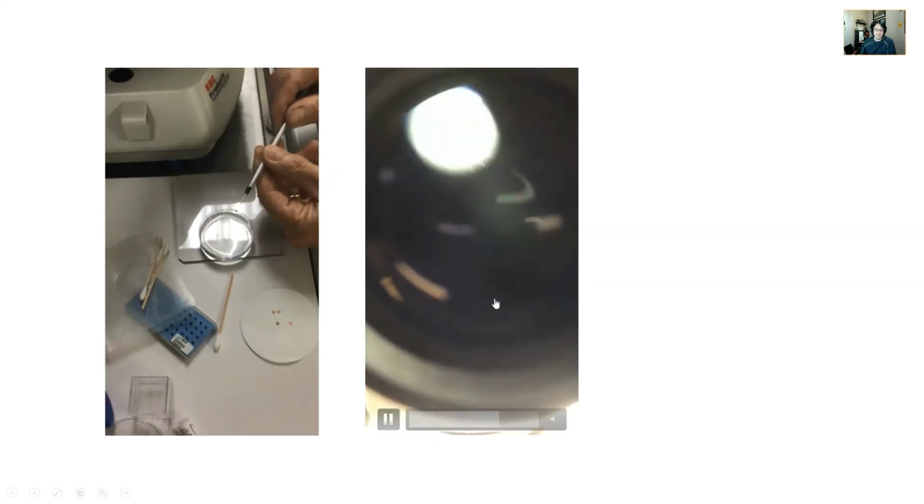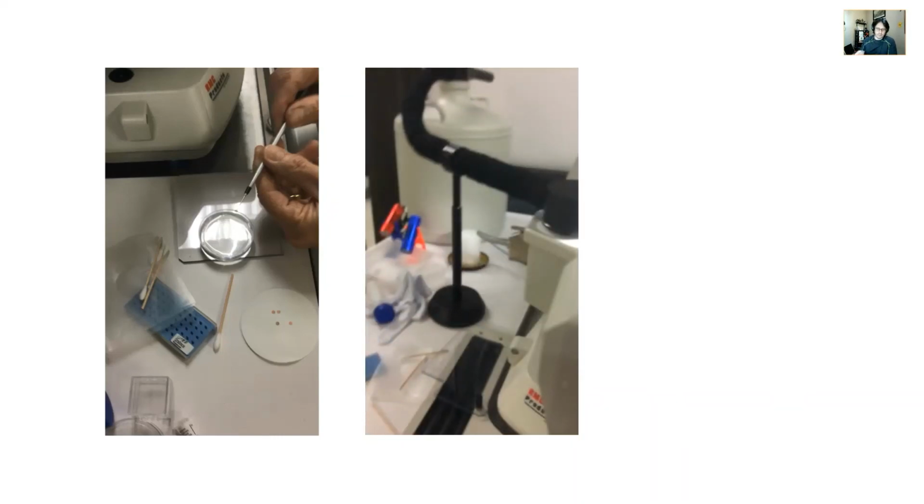You gather them out of water. So we take them off, it's a little pool of a liquid here, and it's DMSO. I think it's dimethyl sulfoxide, diluted. We dilute it with water, but we put the DMSO in there, and it's dangerous because DMSO can actually damage your specimen if you're not careful. But it's diluted. I mean, it's really cold. It's not frozen. It's diluted, and then we gather the specimens and put them on these grids.